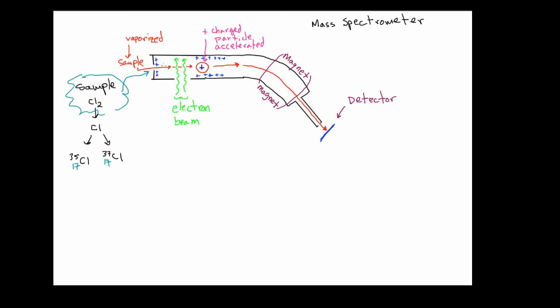The instrument compartment carries a positive voltage, and you can think of the gas traveling down a tube, which I'm going to call a hallway. As the gas moves through the hallway, it's going to encounter an electron beam that's being generated perpendicular to the stream of gas that's moving down the hallway. So the chlorine atoms are going to encounter this beam of electrons, which you can think of as being atomic bullets. That's a good way of thinking about it because everyone can relate to a bullet.